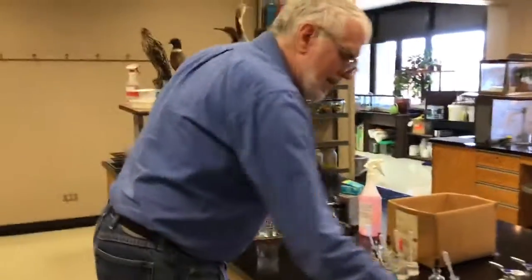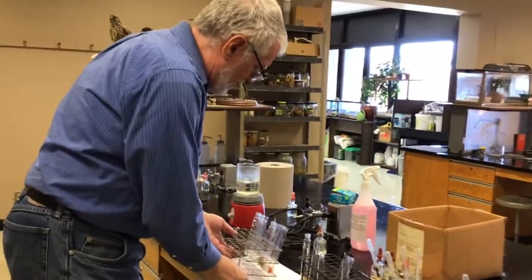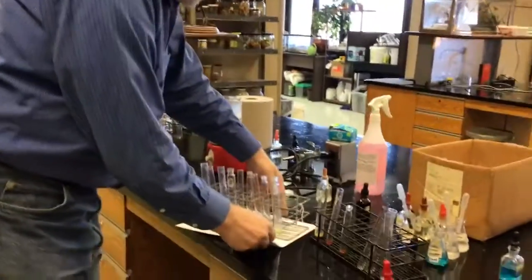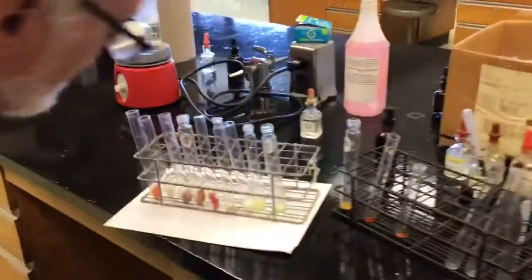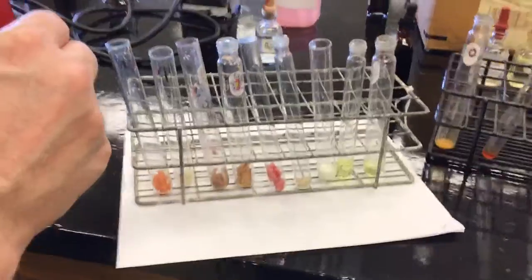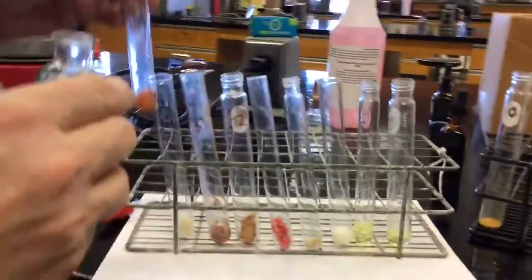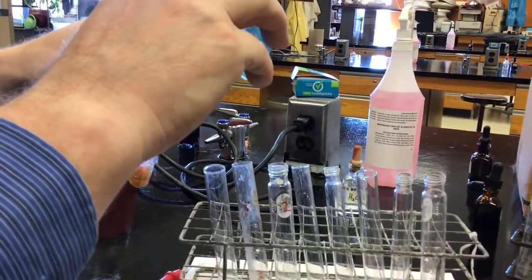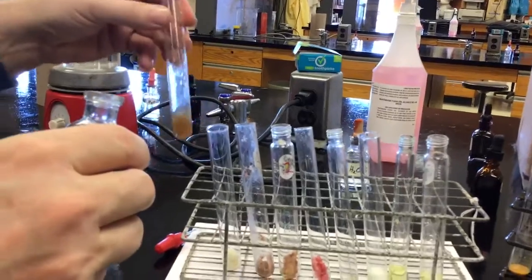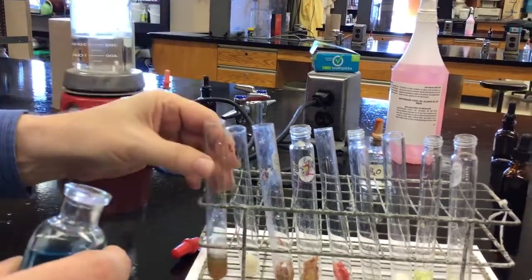I'm gonna use my paper to give you a little bit of contrast. So you can tell which foods they are just by looking at them. Okay, I'm gonna actually pour. Pour and mix. And give it a couple of minutes to check.